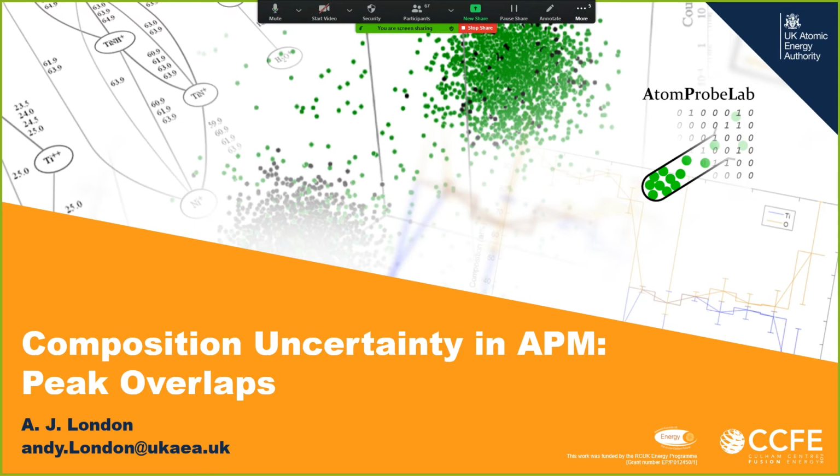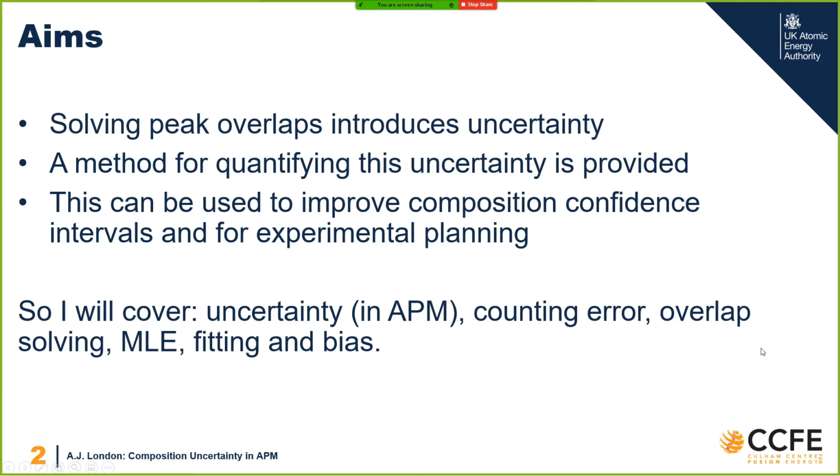hopefully, as well. You should have downloaded the latest zip file, which includes a live script and a PDF output of the live script. So even if you can't get the live script to work for whatever reason, you should be able to read the PDF and get an idea of what's going on. And so when we get to the Matlab practical bits, then you have to follow along with that. I guess I'll go through that as we get into it.